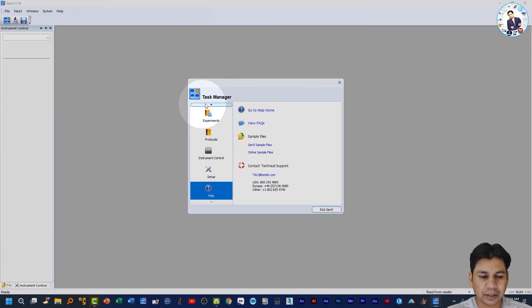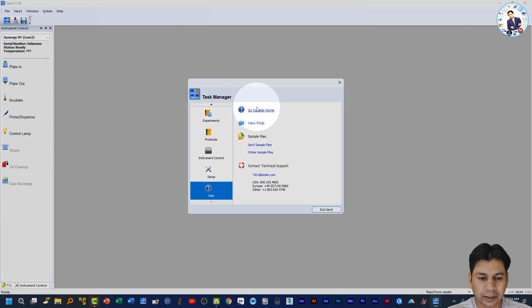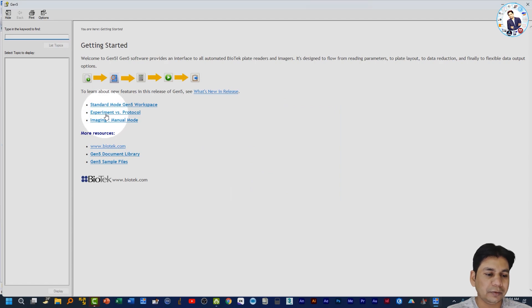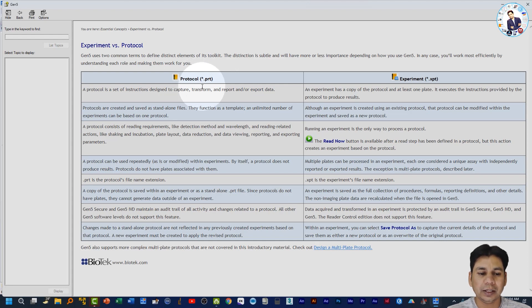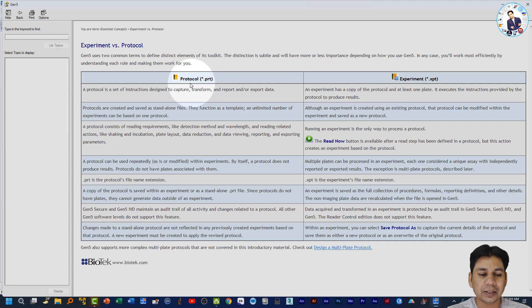You can see on my laptop screen that by default the Task Manager is open. If you click on Help and then click on 'Go to Help Home,' there is a section titled 'Experiment versus Protocol.' If you click there, a window opens in which the difference between protocol and experiment is explained.